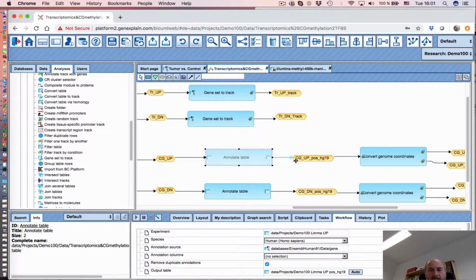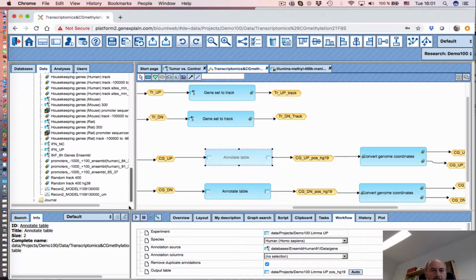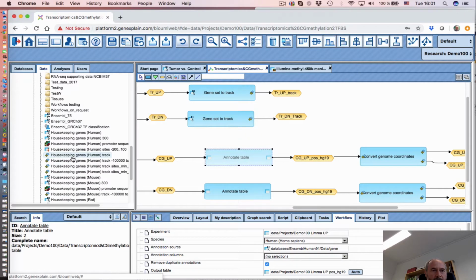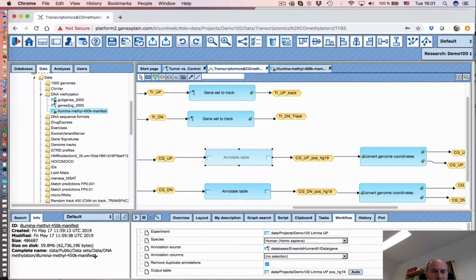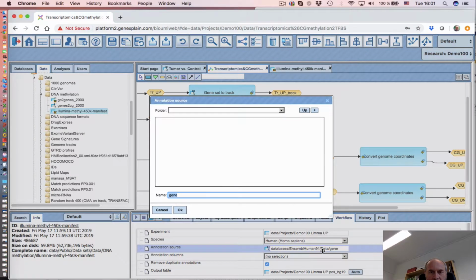As we know, it is in this table which is prepared already in the public repository. So here we had a look. We have to add this table to this folder. So actually we need to simply add the URL of that table here into this folder.